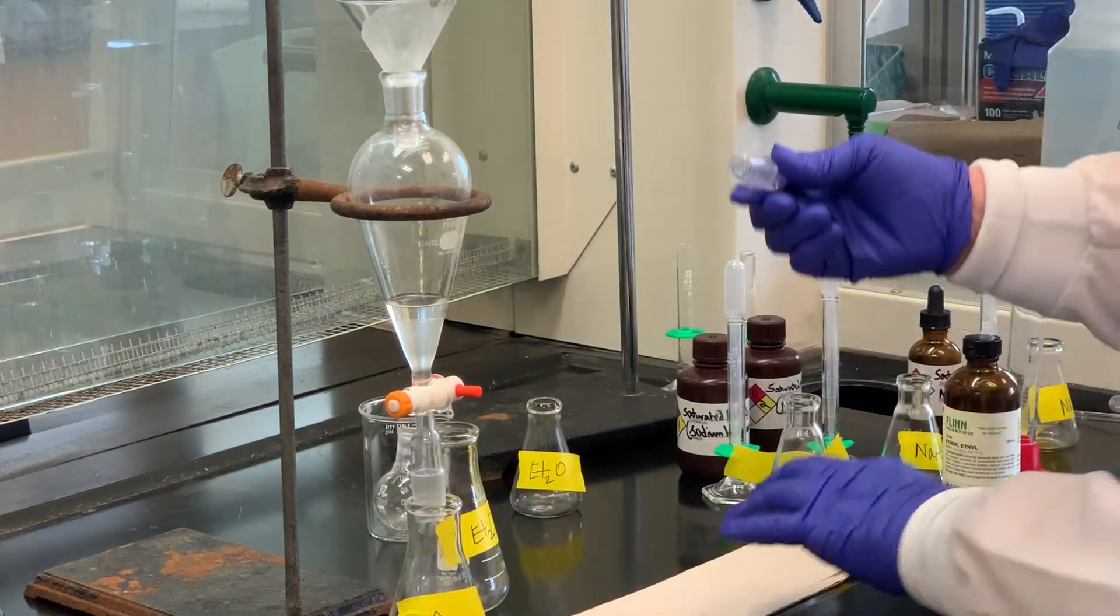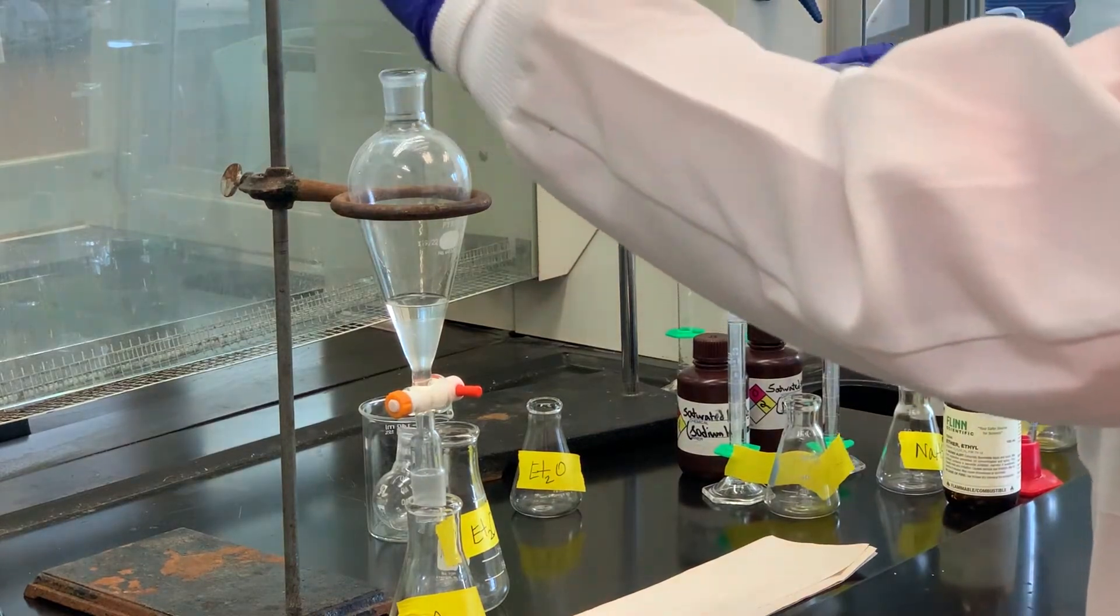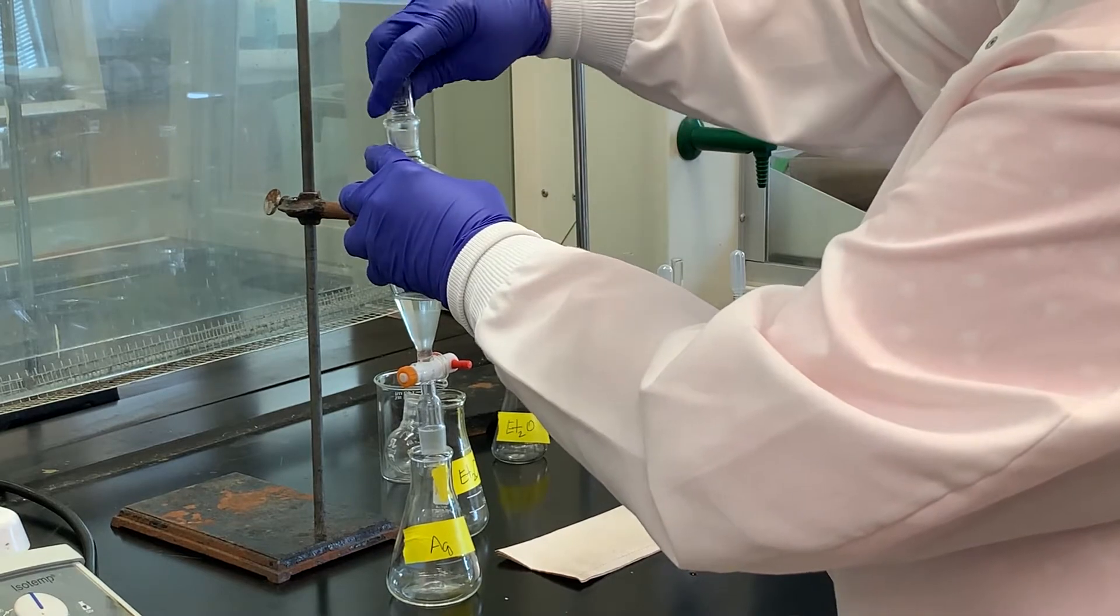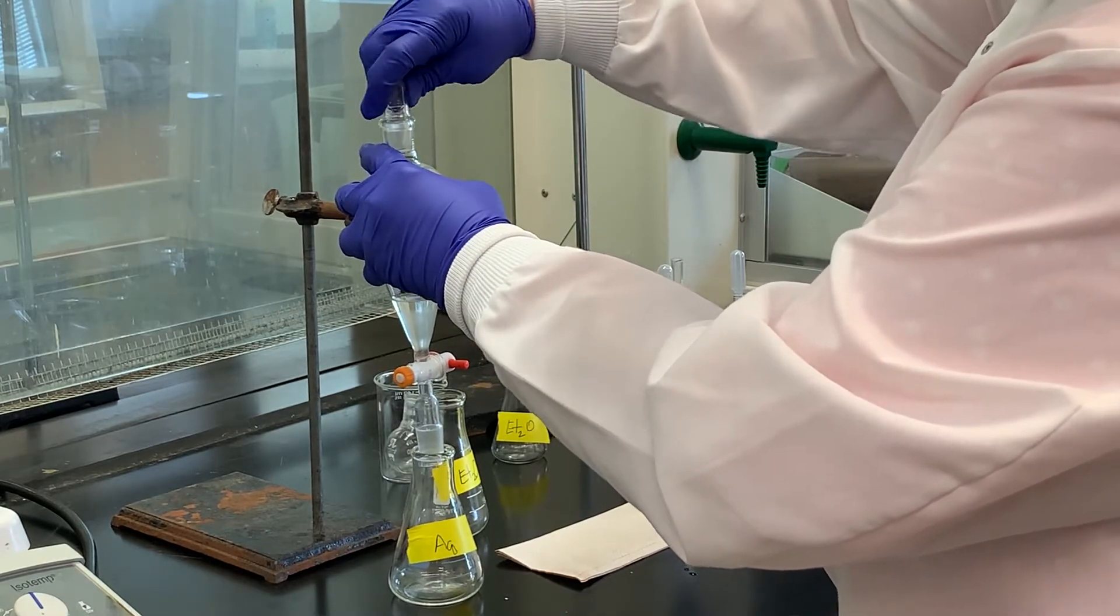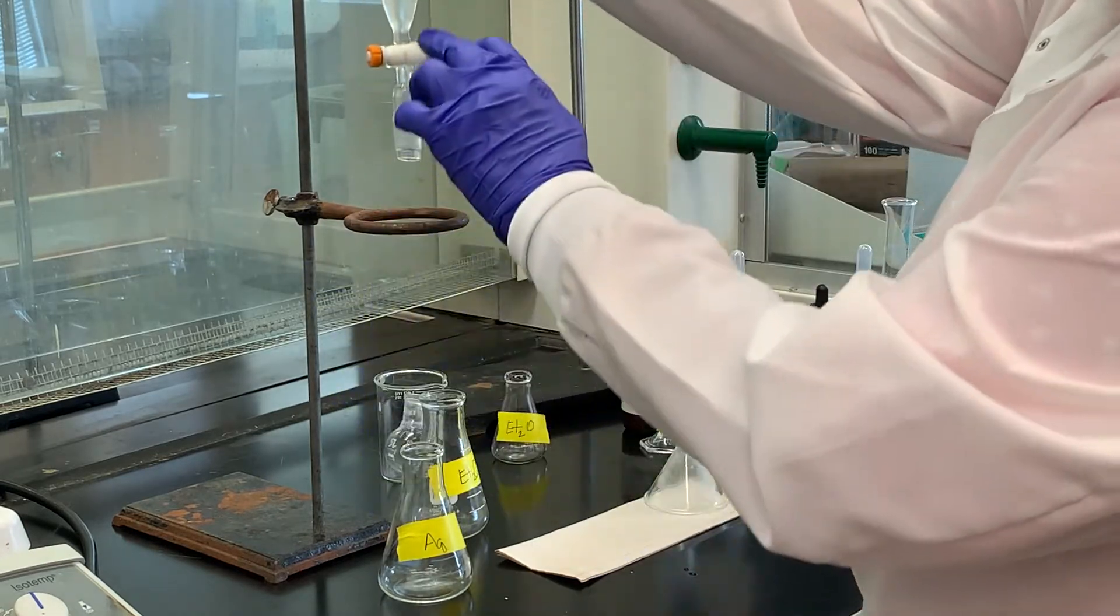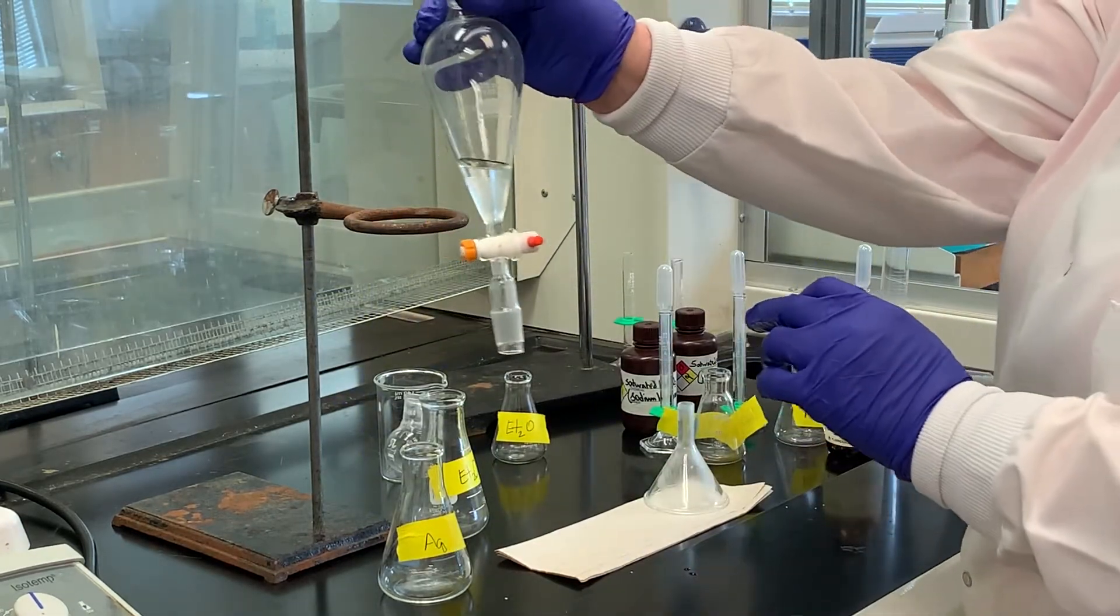I have already greased the stopper. So remember, you always want to make sure that you twist that, rotate it around to make a good seal. I think now we can see the two layers much more clearly.